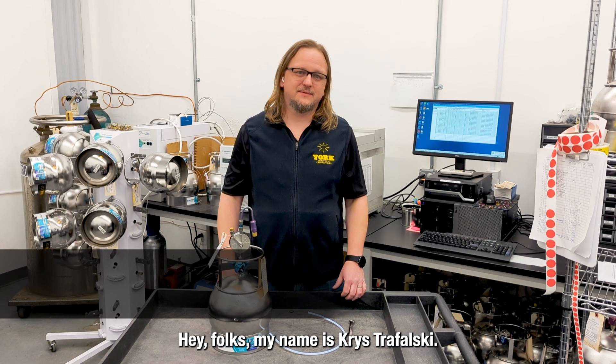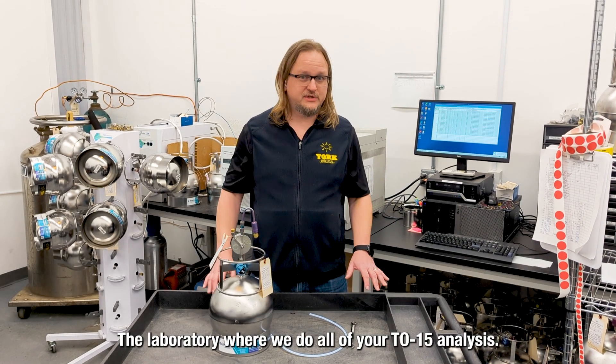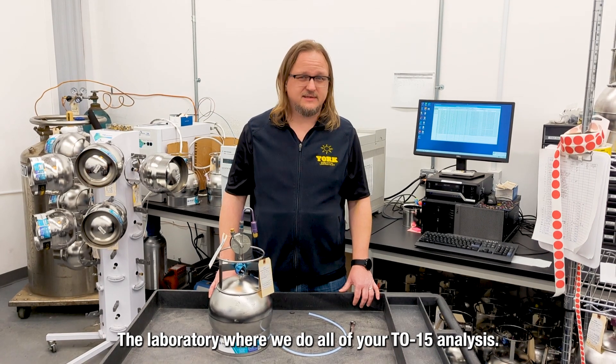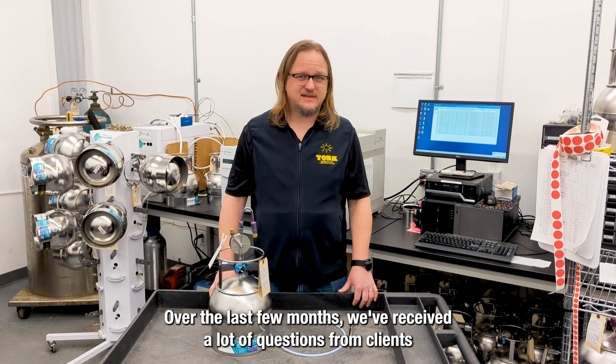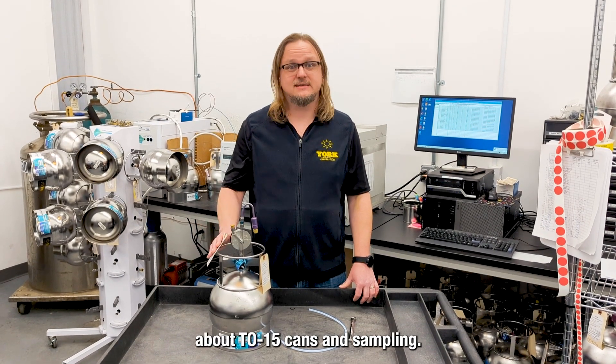Hey folks, my name is Chris Trafalzky, lab director here at York Analytical in Queens — the laboratory where we do all of your TO15 analysis. Over the last few months, we've received a lot of questions from clients about TO15 cans and sampling.